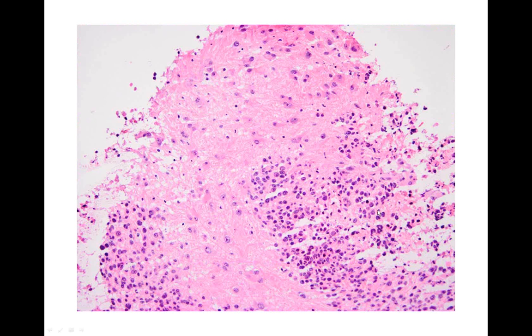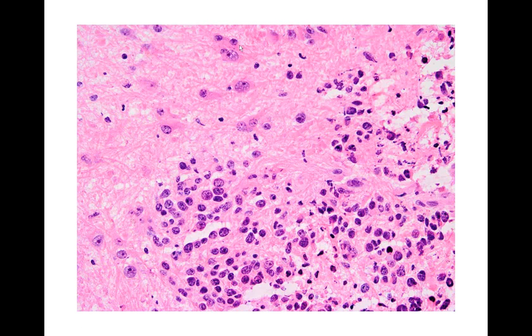Now, in frozen section, you can see the same kind. It looks a lot different, doesn't it? I mean, this is also tumor, so is this. And here's an interesting thing. If we go to higher power in particular, you can see all these wacky-looking cells. These are not tumor cells. These are actually non-neoplastic, non-tumor brain cells, in particular astrocytes, that are reacting to the infiltrative cancer around it.